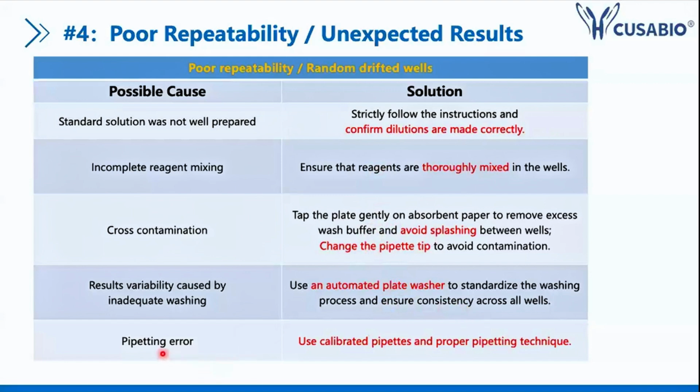For the pipette, I think I said a lot, please be sure your pipette has been calibrated regularly. And another suggestion about pipetting technique is that you can practice the technique using water, multiple times before you start the ELISA experiment.